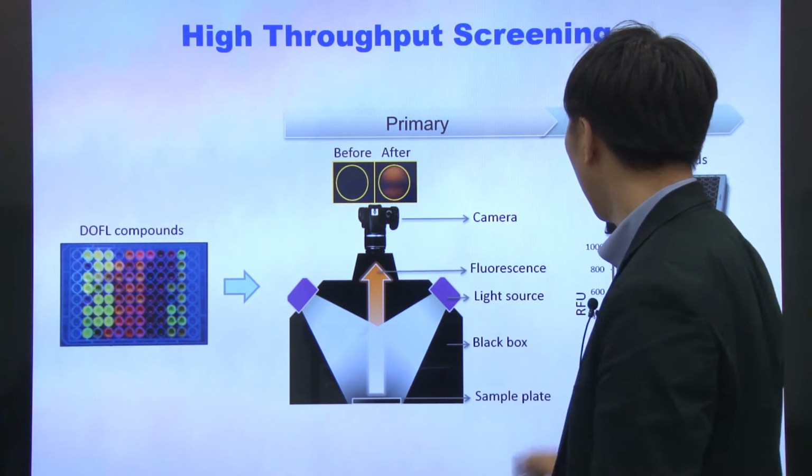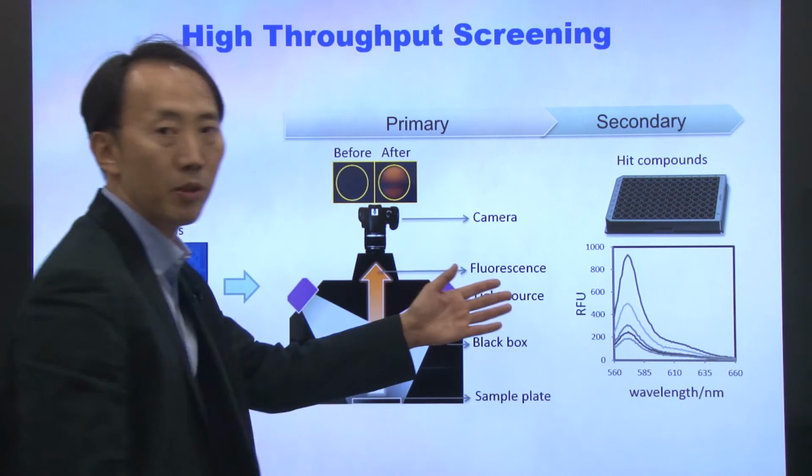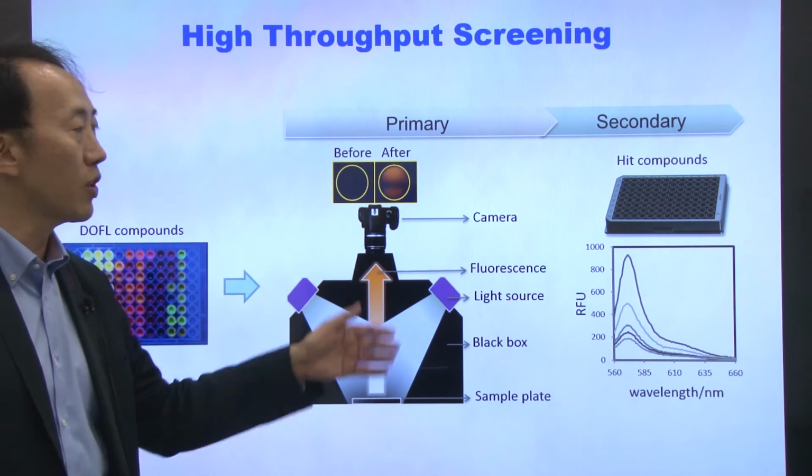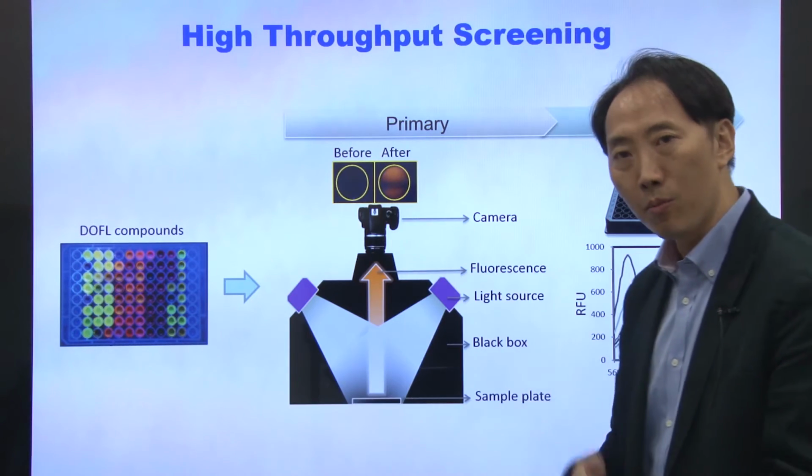Of course, there are some very expensive plate reader type of machines. And in this case, this machine is higher performance, but of course, it's a more expensive way.